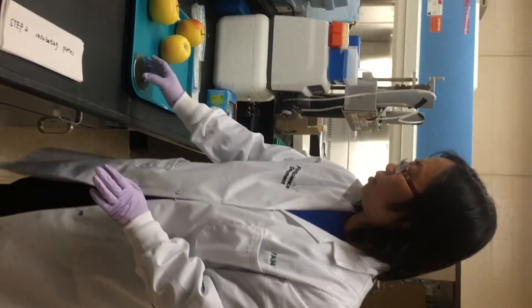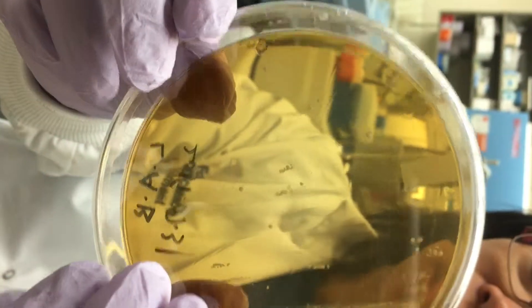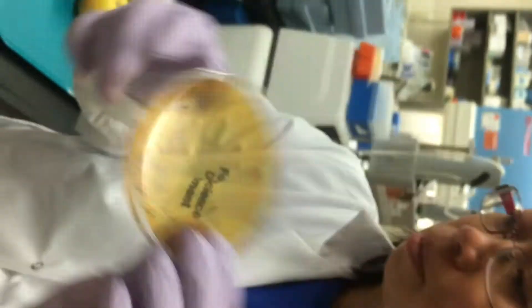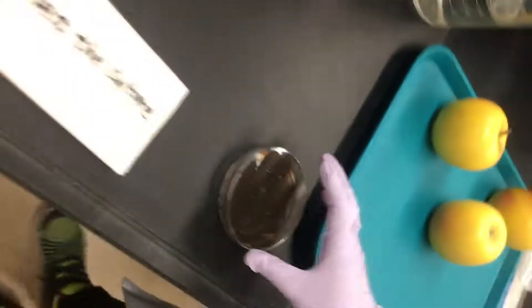After incubating, if you find the white colony, that means the culture is growing. Then move on to the next step to check how the culture is doing.